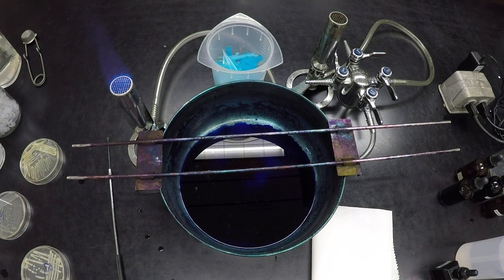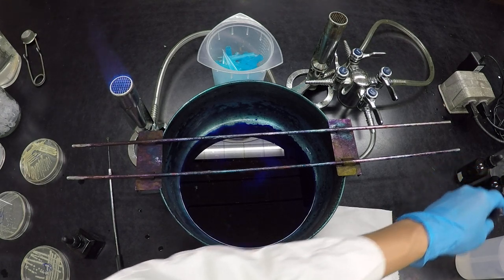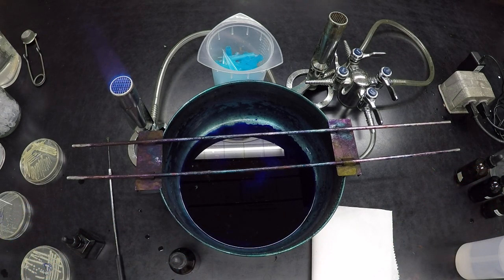Capsule stain is a little different from most of the stains that we're doing. It's also a differential stain because we are going to differentiate between bacteria based on the presence or absence of the capsule, right? But what we can't really do is color the capsule. It doesn't have a nice defined structure for us to color. So what we're going to do is call a negative stain. We're going to color everything except the capsule.